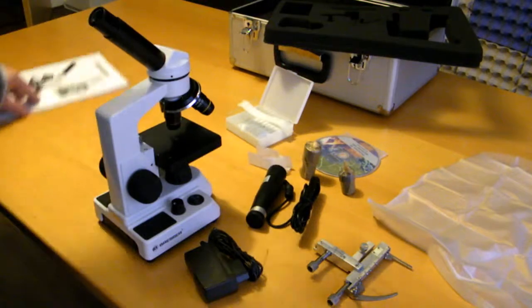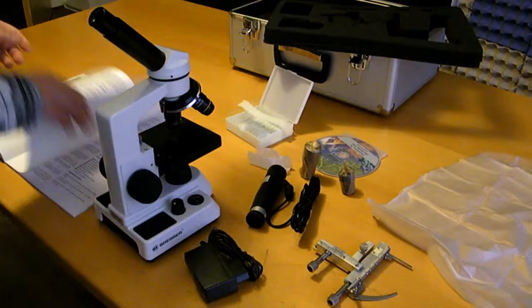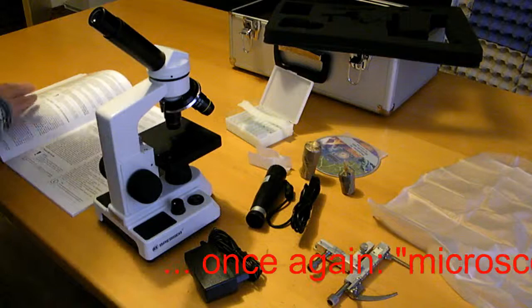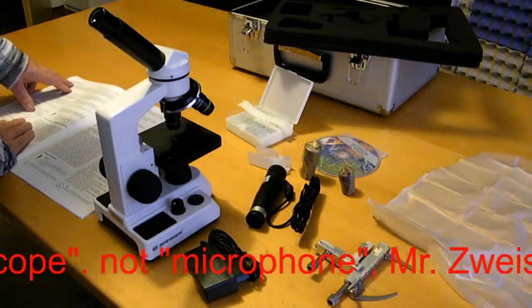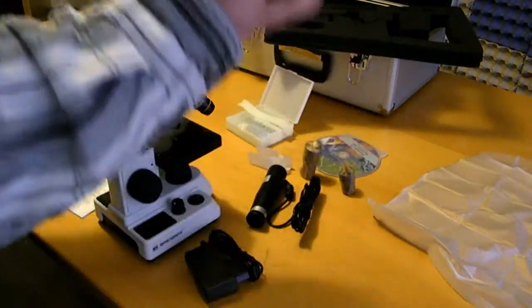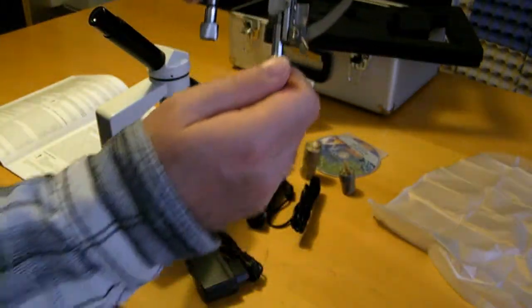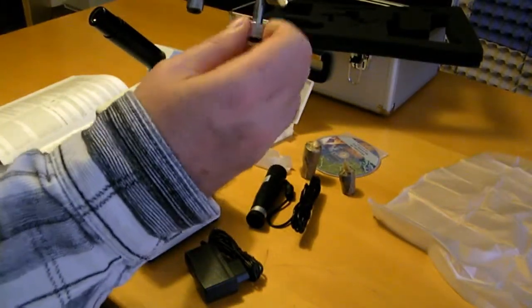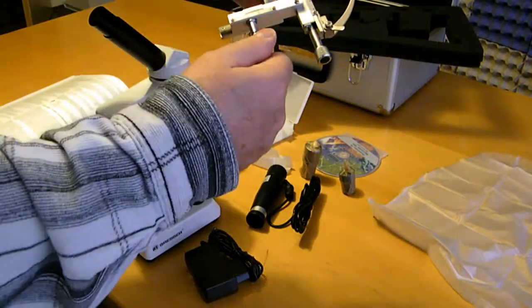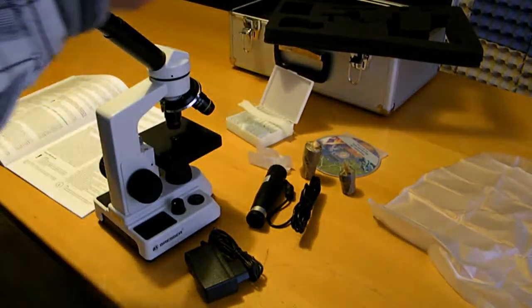The first thing I have read here in this manual, the first thing to do is to install the microscope completely. And here we need the microscope's slide stage, that's this animal here, to adjust the things you are looking at the best way, to observe them. But how to do this?